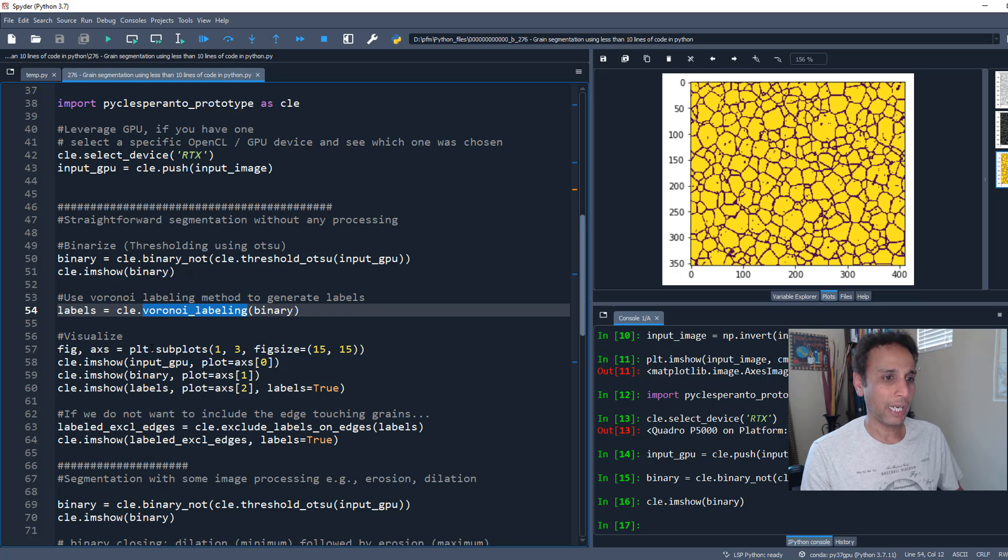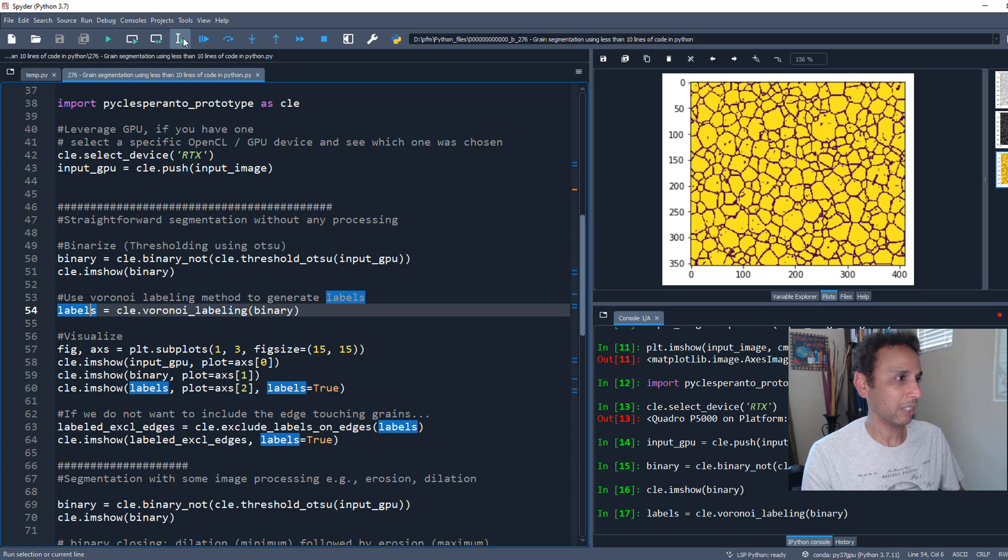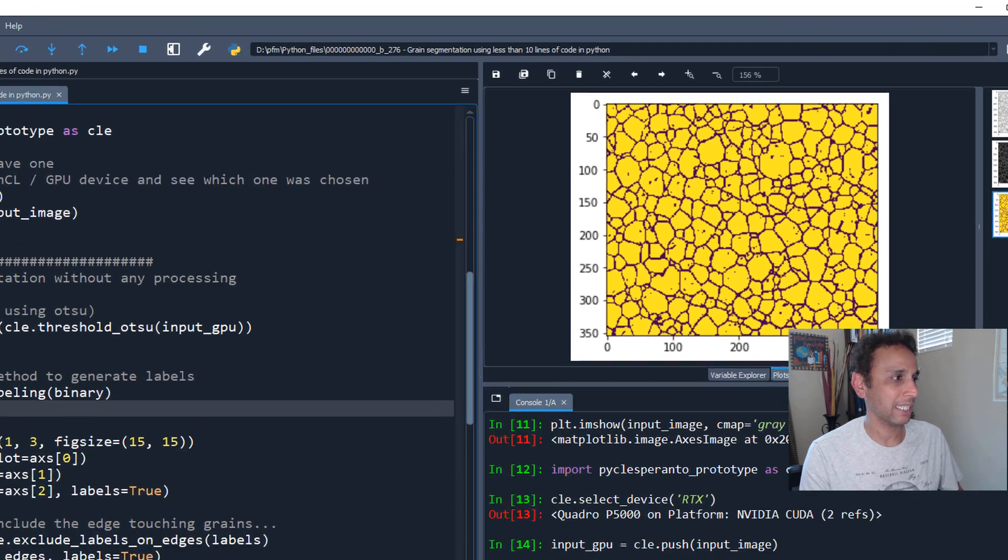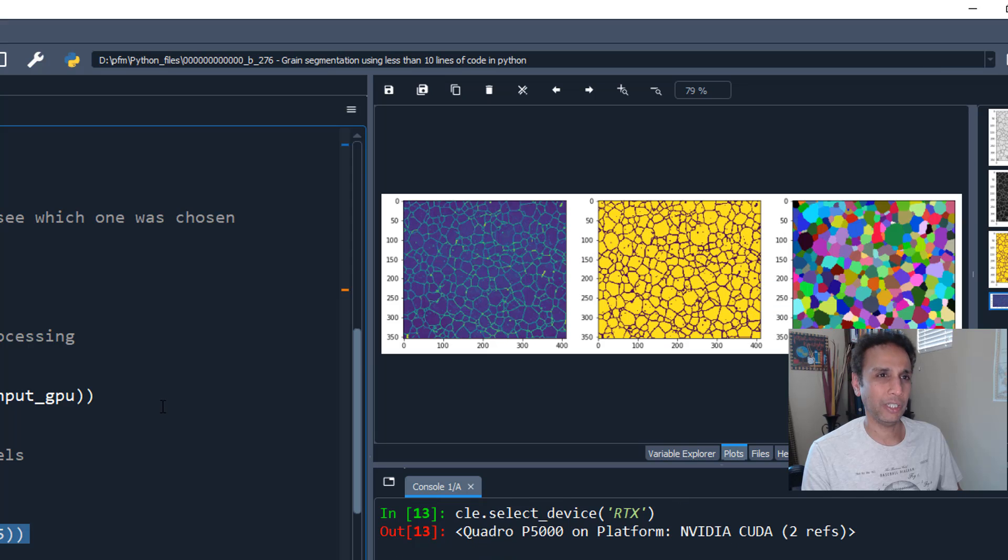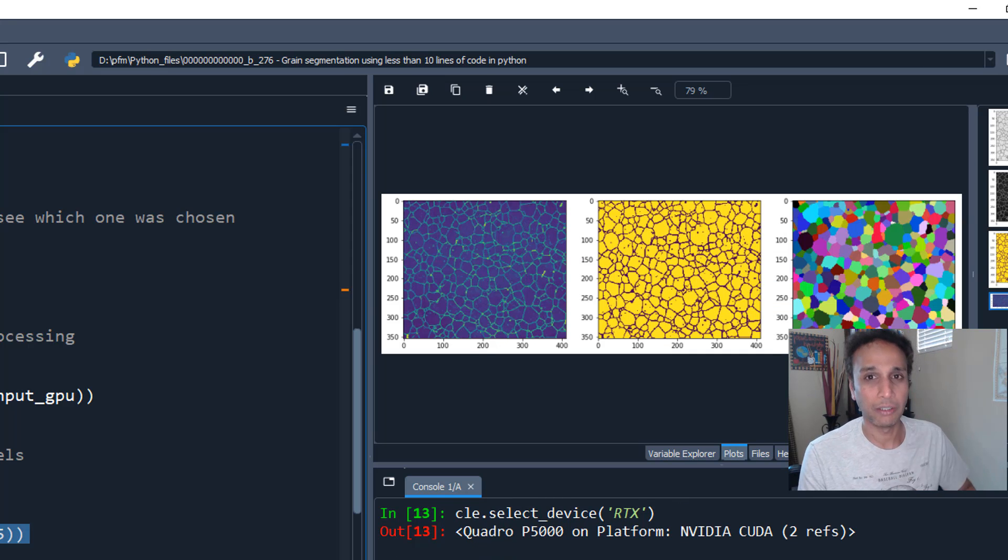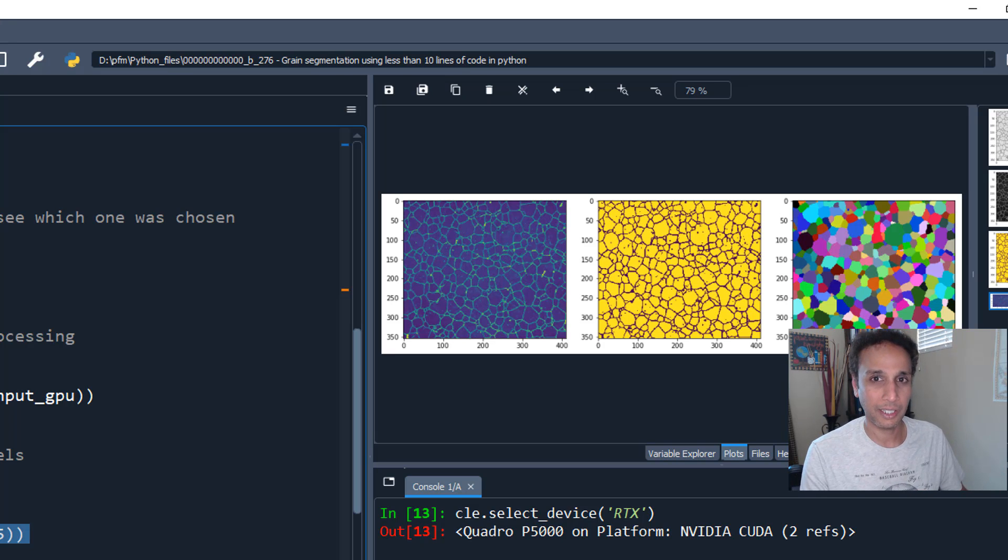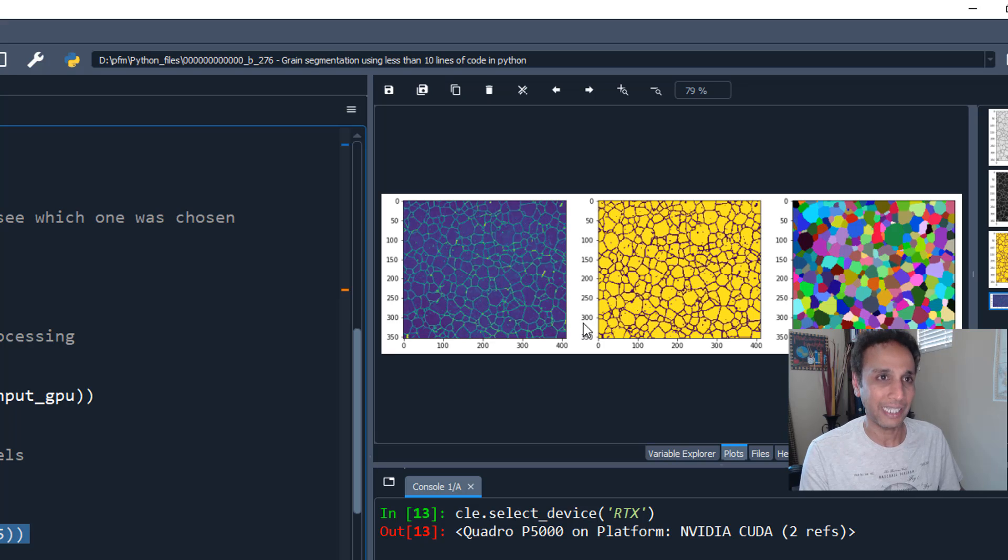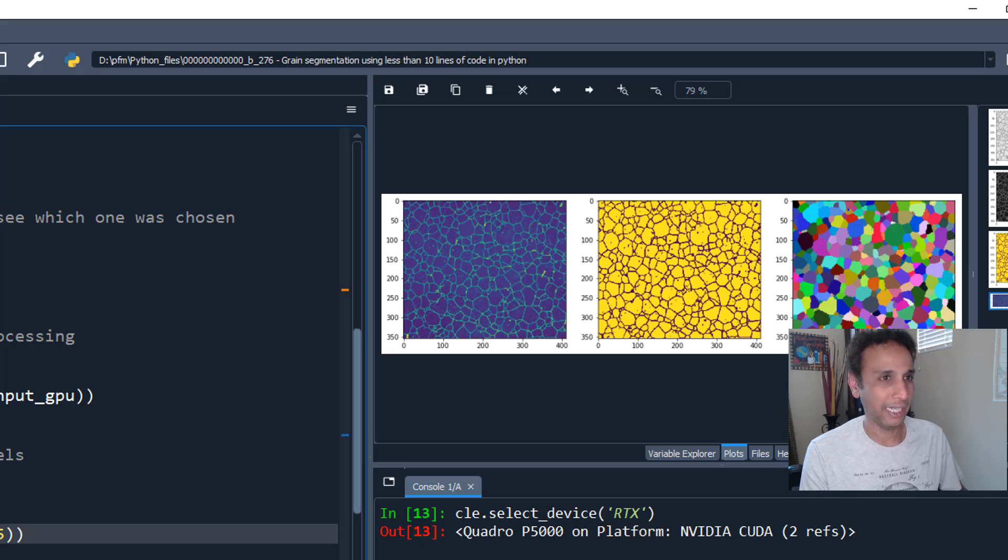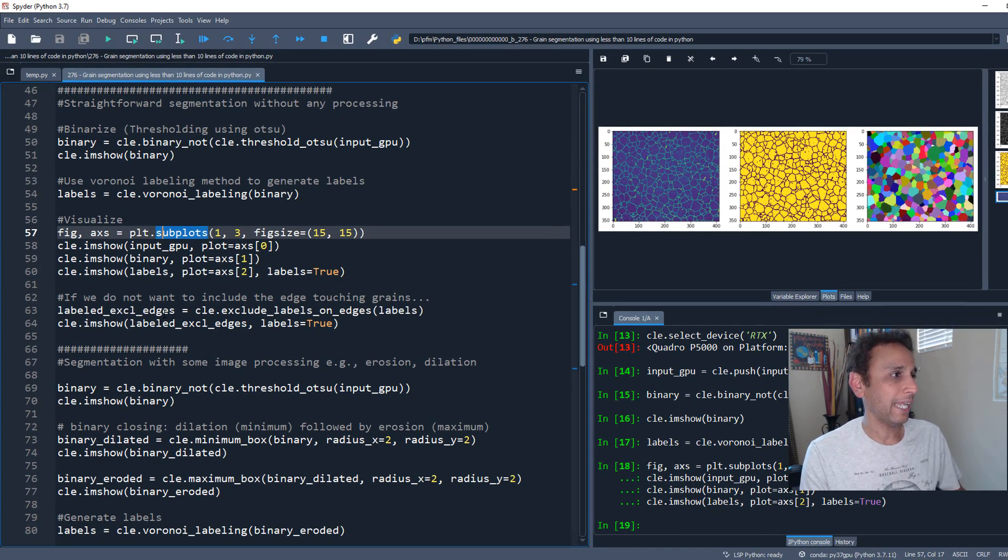Let's apply our labels - generate our labels using watershed labeling. Now visualize it. This is exactly what we did with the nine lines of code. We have our image, we thresholded it, inverted it, and provided this as input to our watershed labeling. It did an amazing job in labeling.